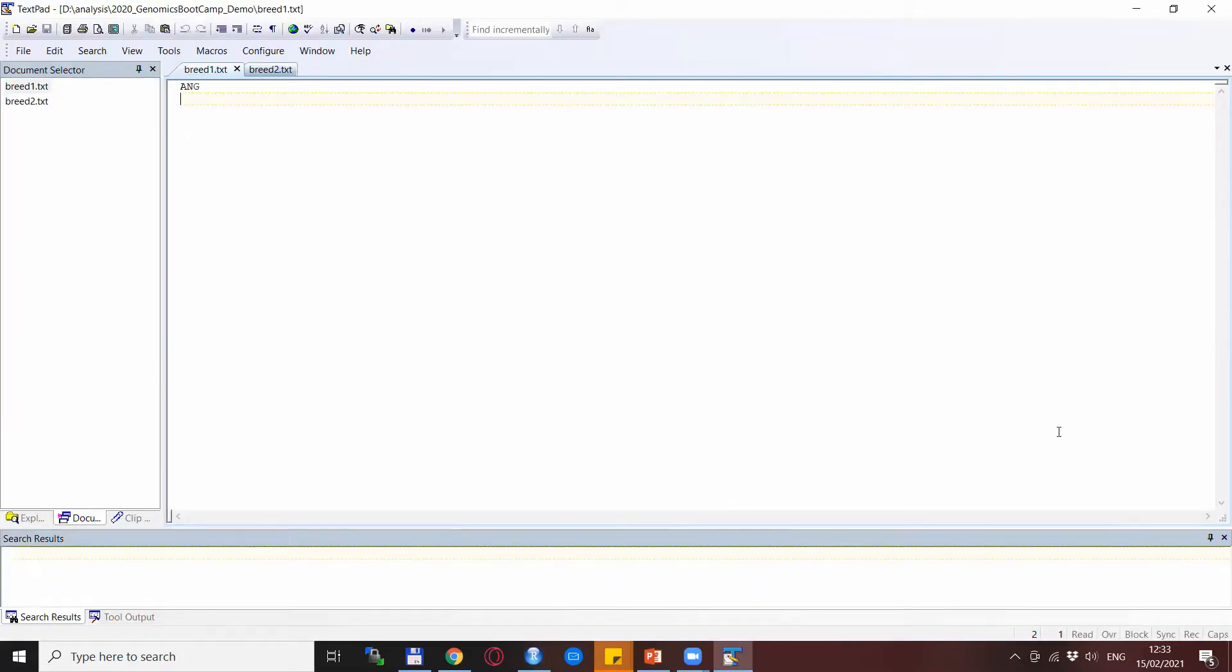This is how the text files look like. You see that this is just the family file name for a breed.